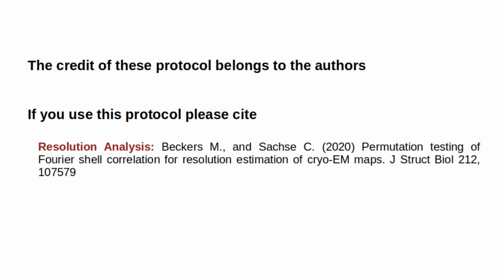Hi, in this video we are going to explain the resolution analysis protocol of the SPOC plugin. This method has been developed by Maximilian Beckers and Carsten Sachse. If you use this protocol, please cite this reference.